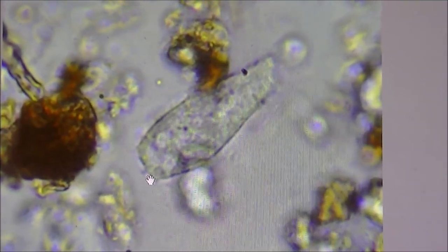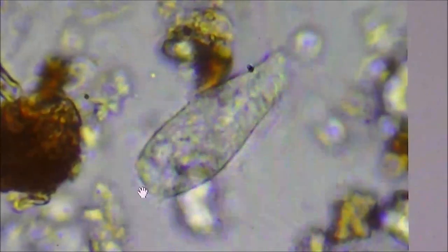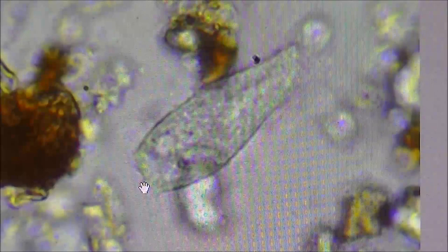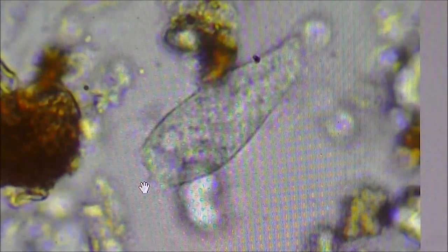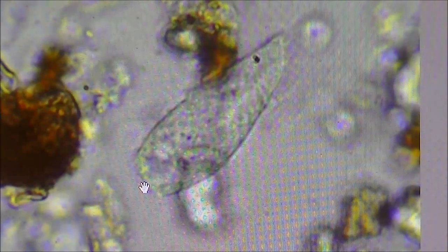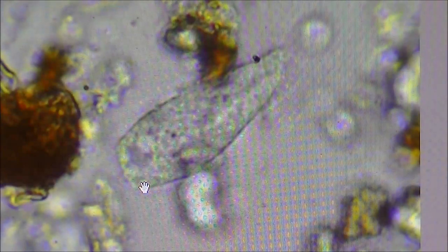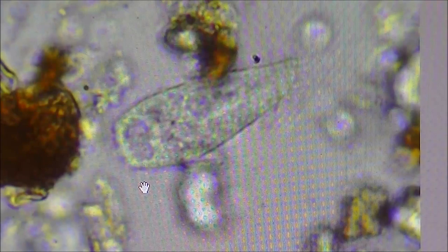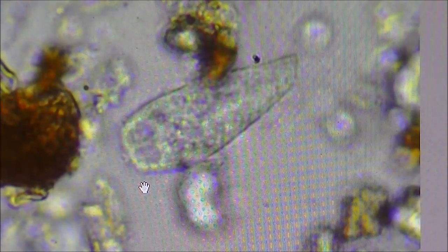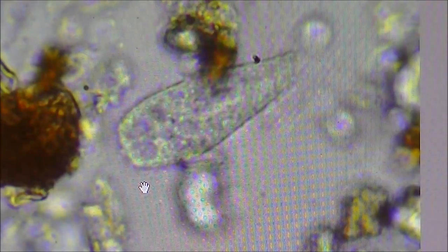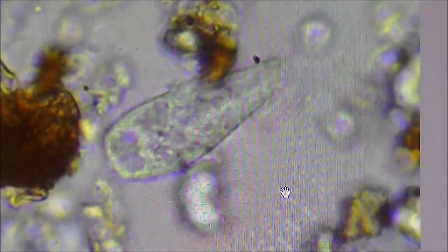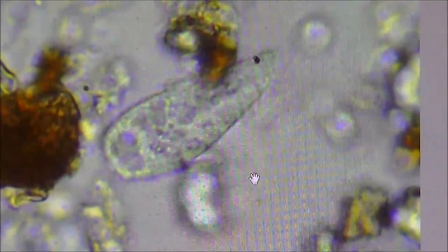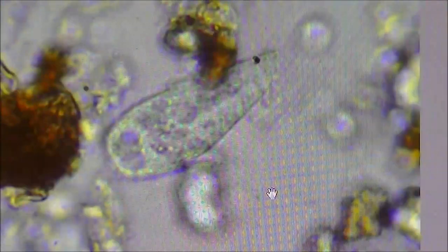It's very docile. This thing would just be moving around so quickly, just vacuuming up bacteria all the time. And that's what it does. After two and a half hours now, I finally found one that's pretty much still alive. They're not plentiful.